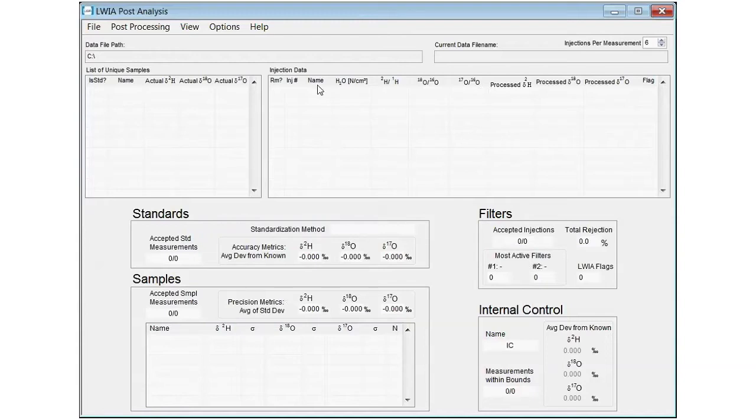We'll start off by showing you this handy little help menu here, which will get you directly to the user manual of this software. So if you have any questions, this is always the first place to start. So let's jump right in, analyzing some data.